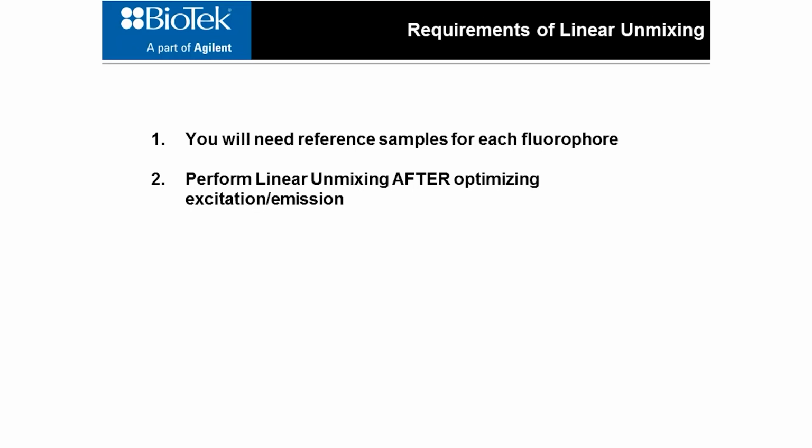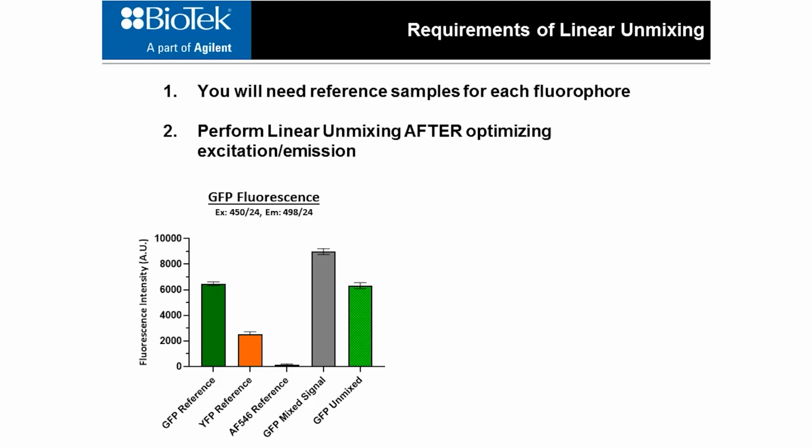And as an example here, what I've done is demonstrated this using cell lysates from cells expressing either GFP, YFP, or a purified dye, Alexa Fluor 546. And as you can see in the first three columns of this graph, these are the signals coming from these standards.